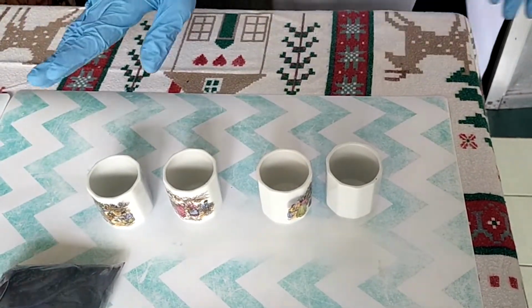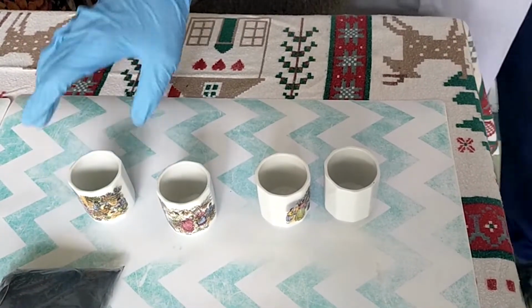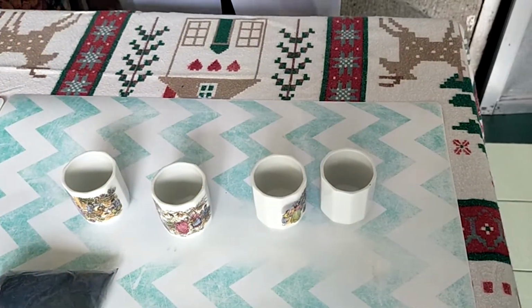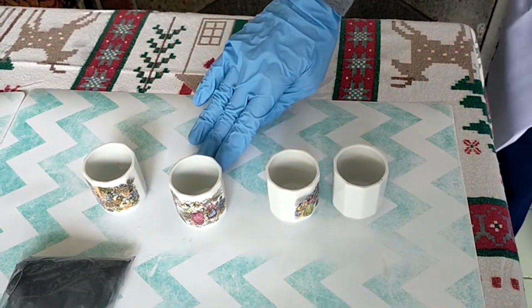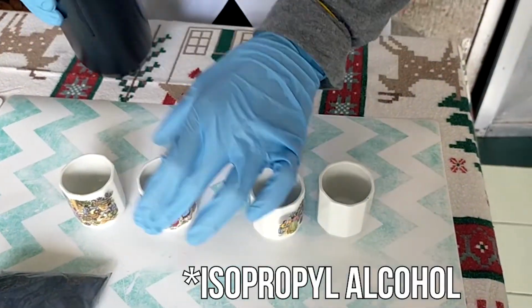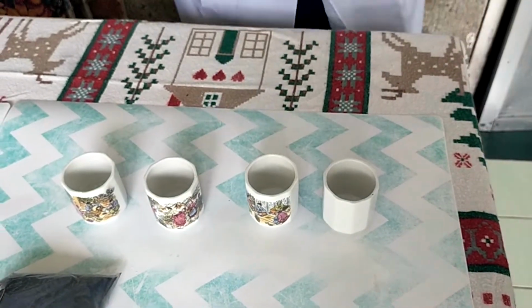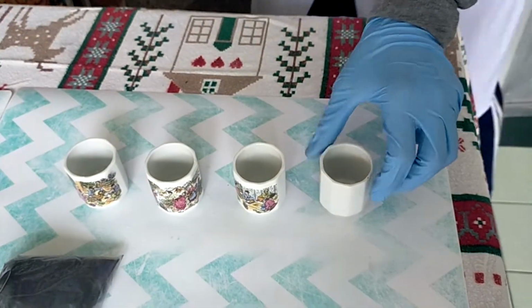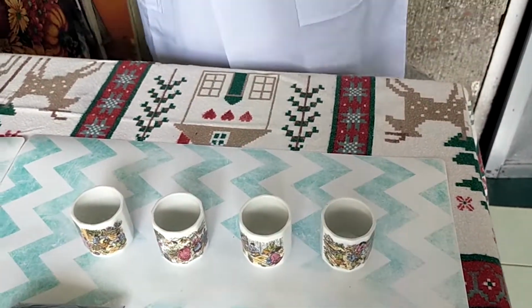In this cup I will be putting distilled water. Here I will be putting isopropyl alcohol. Here I will be putting ethanol. Lastly, here I will be putting ethyl acetate.